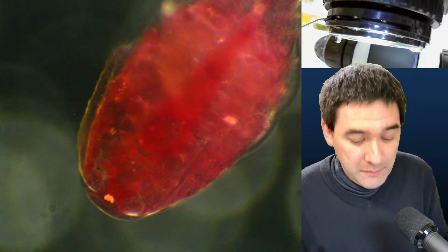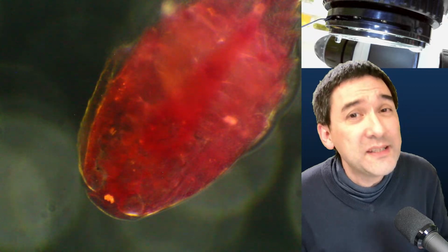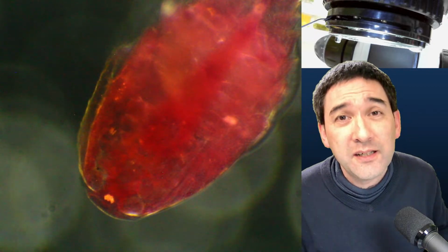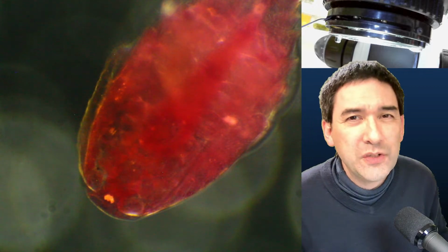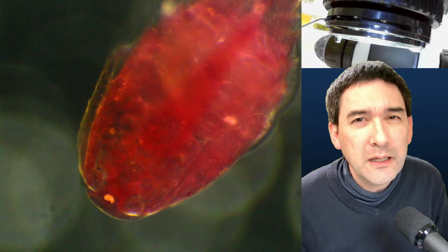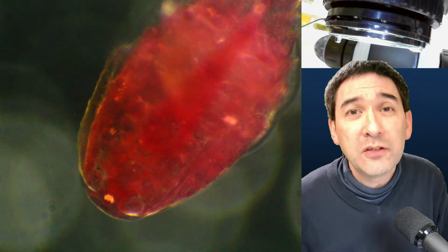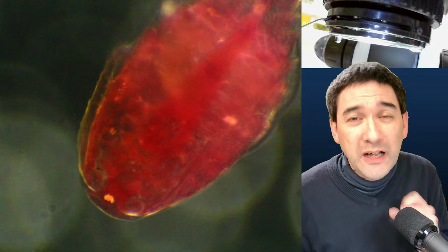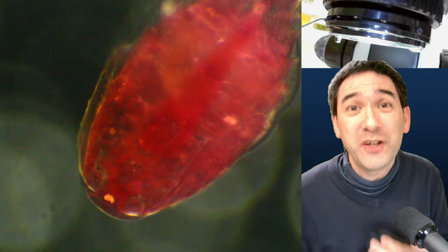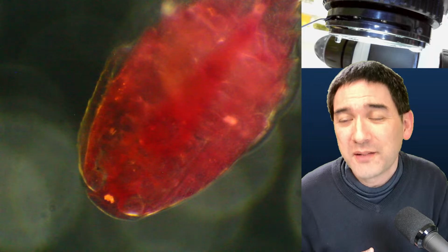Yeah, and this can actually be used to increase the contrast. I read somewhere that back in the 19th century, when microscopes did not have quite the resolving power, some of the microbiologists at that time liked to use oblique illumination to look at bacteria, because then you could actually see them much better. Yeah, so it is actually a very old technique, and has been around for quite some time.